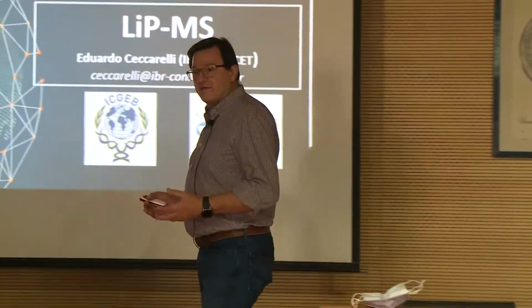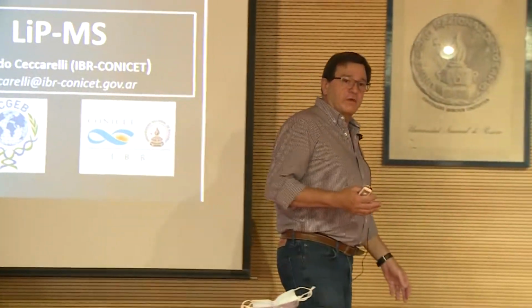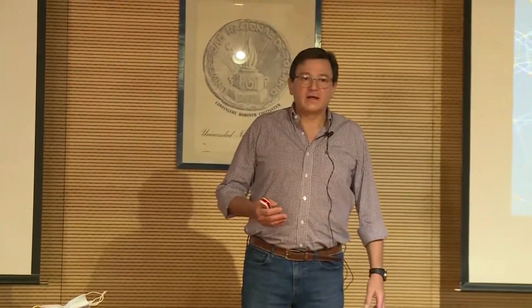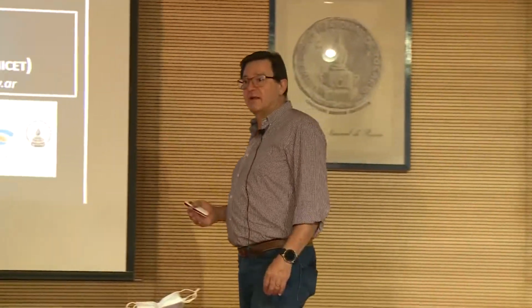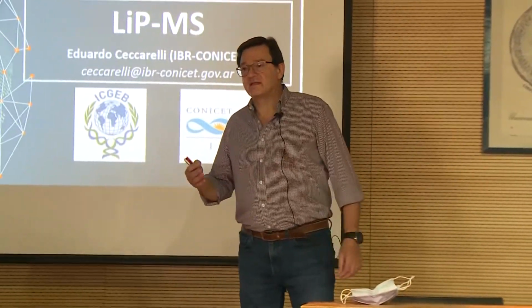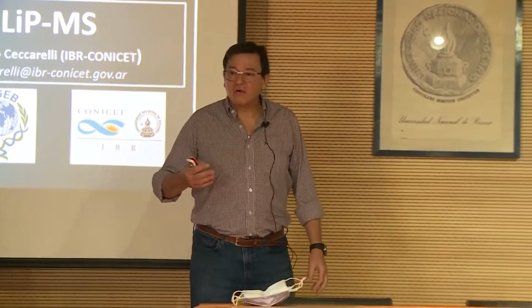I will talk about a methodology that, to tell the truth, I will never perform myself, neither my group. We worked before with limited proteolysis, but we never tried this technique. But I found this technique really nice. I think it's a powerful technique.